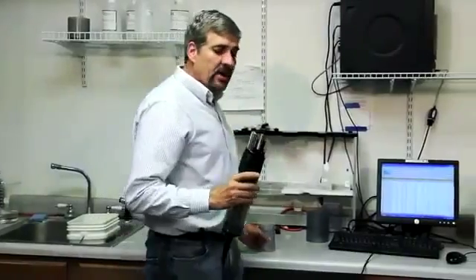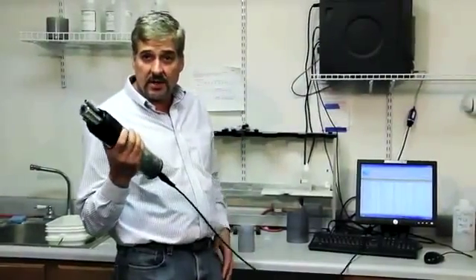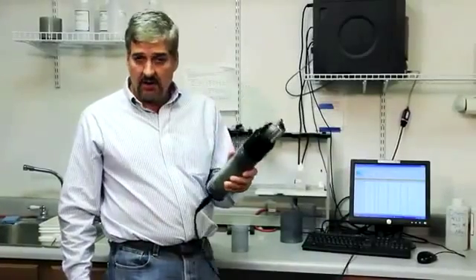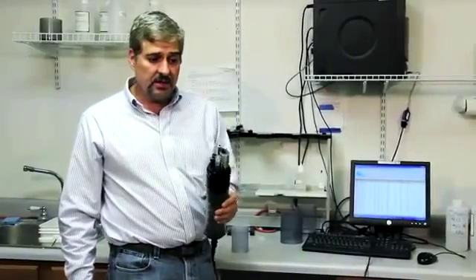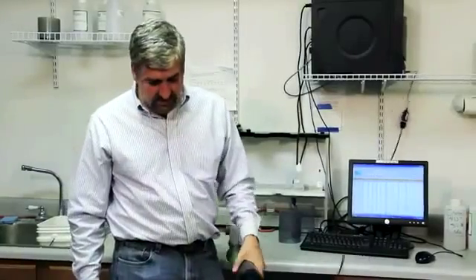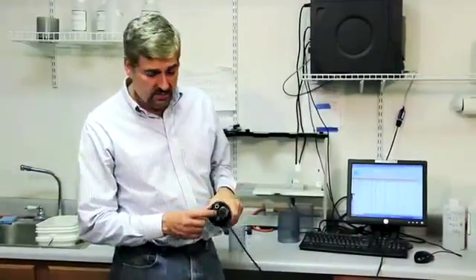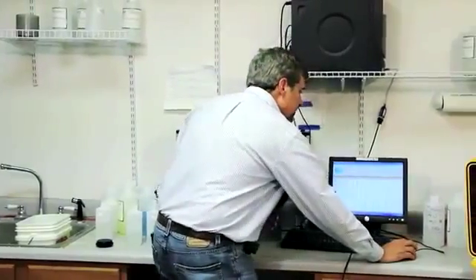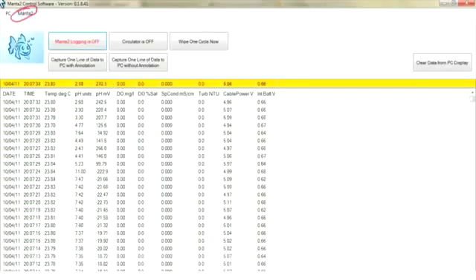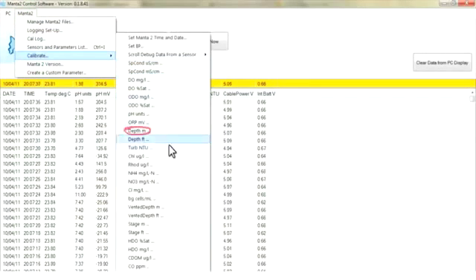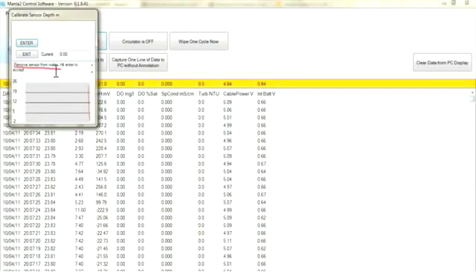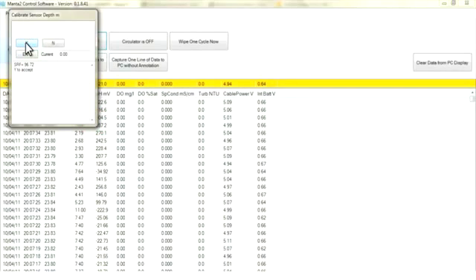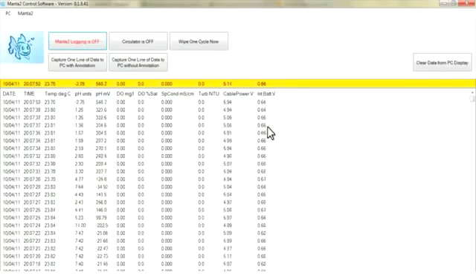Now we're going to calibrate depth. Depth is just calibrated to air. We want the value right here to read 0 in air. So you just remove, rinse, make sure nothing's blocking the hole that's right there for depth, for your depth sensor. We go to Manta 2. Calibrate. Depth. It says remove sensor from water. Hit enter to accept. We're going to hit enter. It says press Y to accept. Now we calibrated depth. It's that simple.